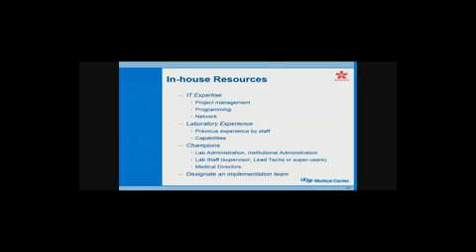Laboratory experience. Does your staff have experience in barcoding somewhere else, or have they done something like that somewhere else, even if it's a different type of job? Do they have experience in this kind of system or projects? Just simply managing projects, working on projects. There's a lot of testing and things involved. So if you have people that have that capability, have that experience, that's very helpful.